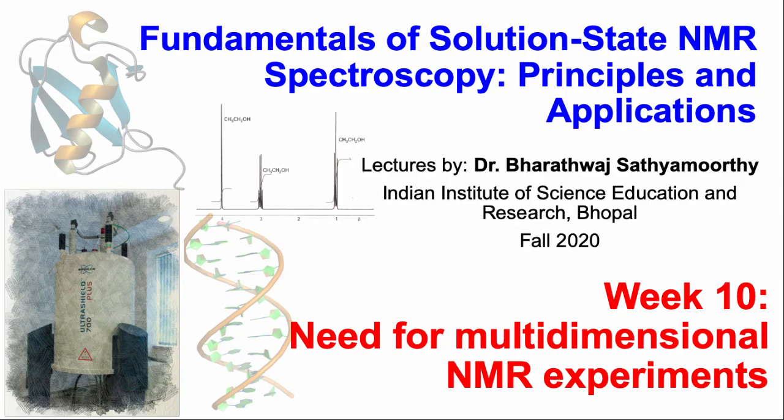With this being the premise, I hope this has established a clear understanding that multidimensional NMR experiments are indispensable in trying to characterize biomolecules such as proteins and nucleic acids.